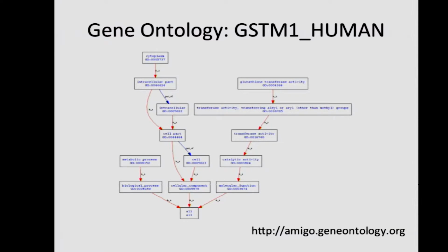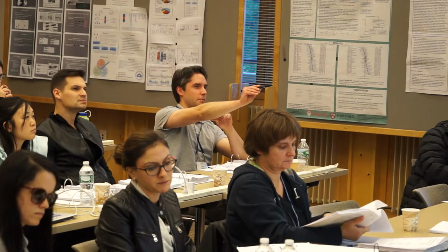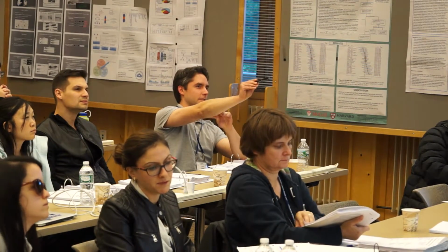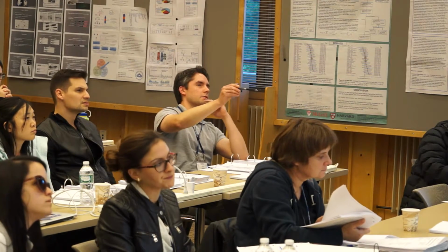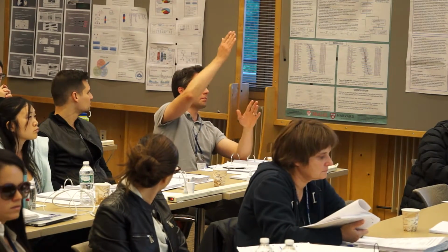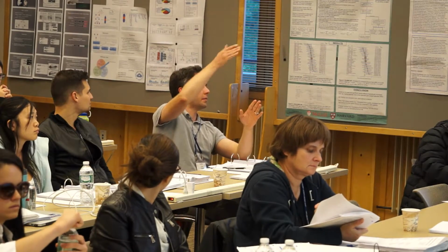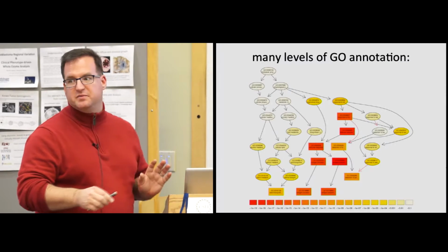You can see that for the middle branch, it actually kind of seems to go back a little bit. But it doesn't matter. You're comparing specific terms individually, right? When you do these comparisons, it doesn't really matter what branch it's on or how many steps there were before. In this initial way of doing it, we're just going to do each one of these by themselves.